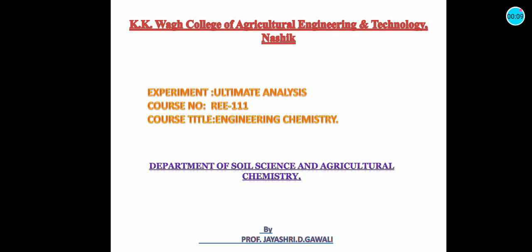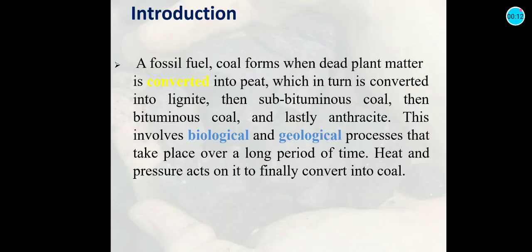Today we will discuss the experiment of ultimate analysis. Then let us see the introduction.